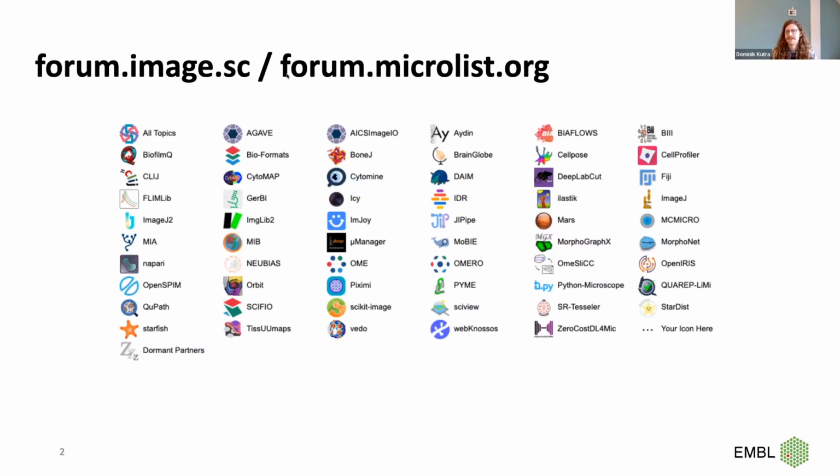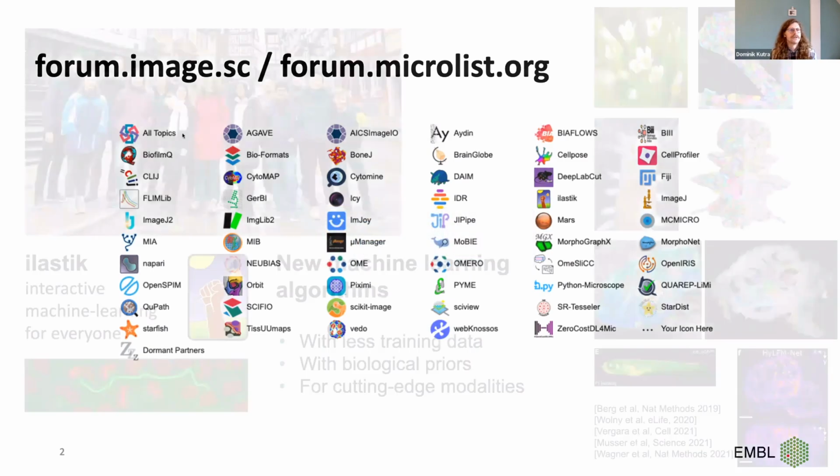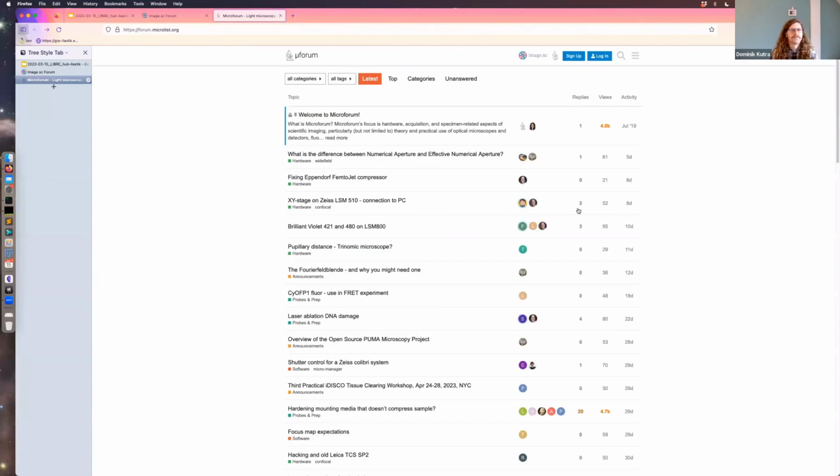While I was on there, I also discovered that there is this forum microlist.org. I don't know if you even know it, and I have also not interacted on this forum much, but on the website, if I quickly go there, oops. So this is also a forum in a similar manner, I think, with the same motivation to bring people together who work on microscopy hardware. And maybe this is also a good way for your community to interact a little bit there.